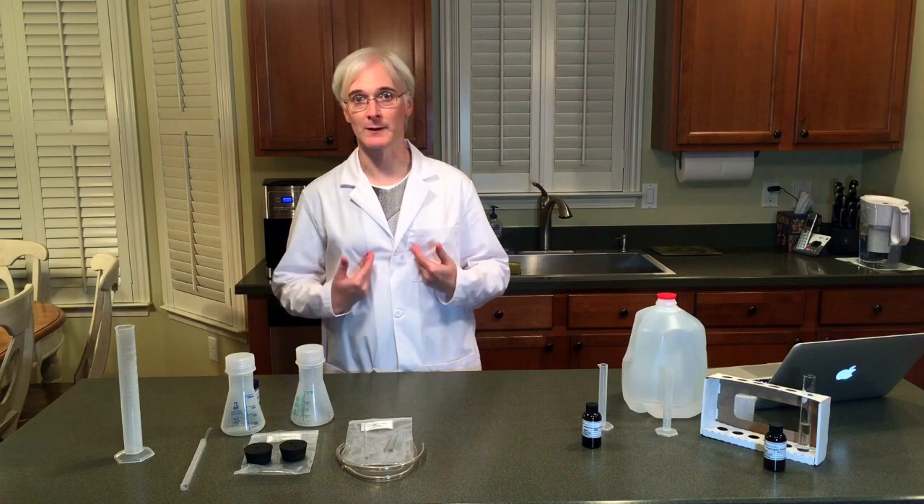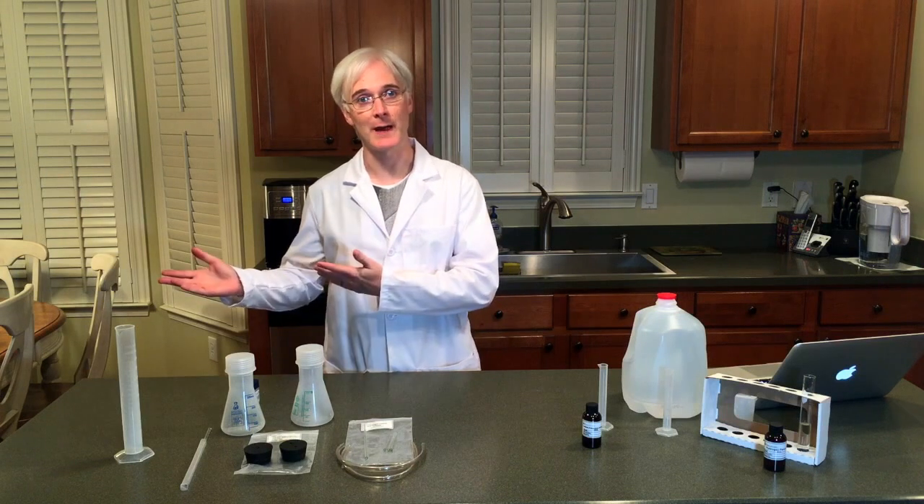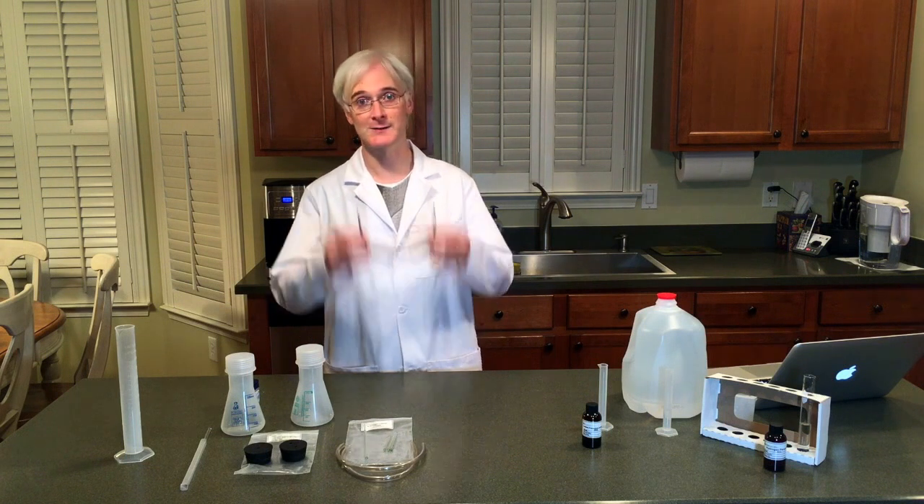One thing — I've got a lab coat on. You have the aprons. It's always advisable to do that. Whenever you're doing a lab, even though I wear glasses, safety goggles are imperative. Do not wear contacts when you're doing any kind of lab work.